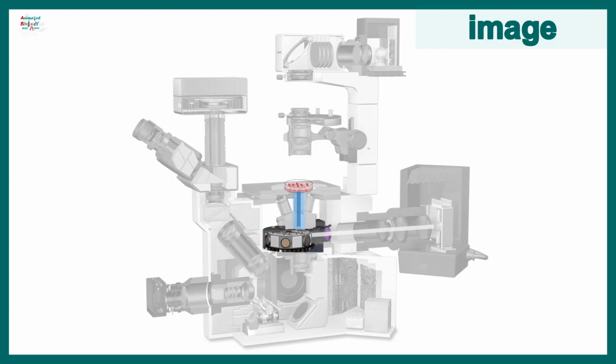And obviously the fluorescence would be emitted and pass through the objective lens. Then with the combination of mirrors, it gets deflected and it can pass through specific prisms and an array of lenses. Either it can come to the detector, that means the camera, to be detected, or it could be diverted towards the eyepiece as well.